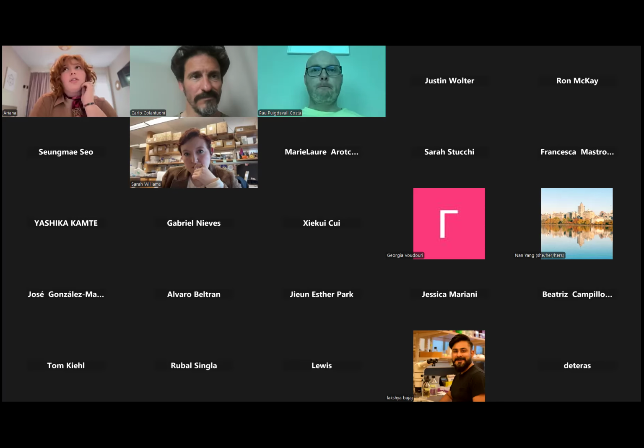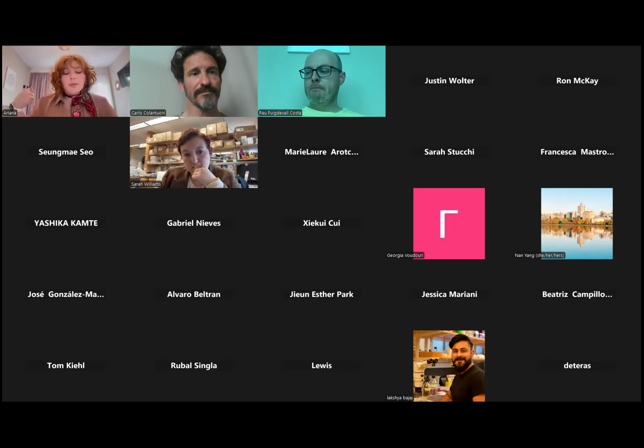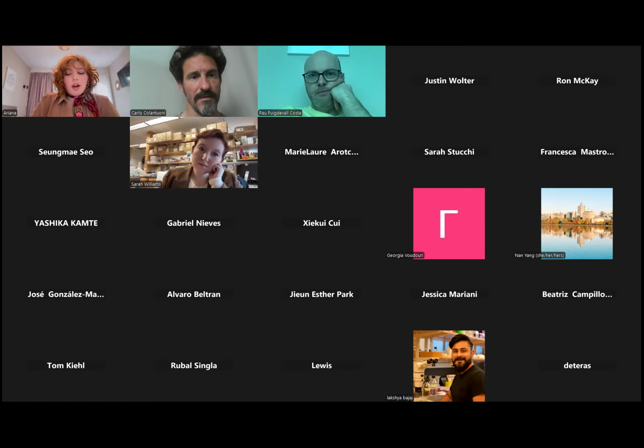Yeah, of course. So for the start, there are many different exposures that you can do, and they can start at different time points. You can expose the organoids, then remove the exposure. There are definitely different designs. For us, we started at day 35 because at this stage we see both progenitors and neurons. So we wanted to capture the exposure in both.